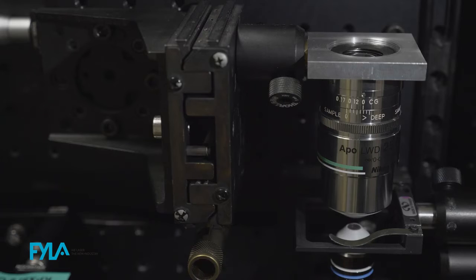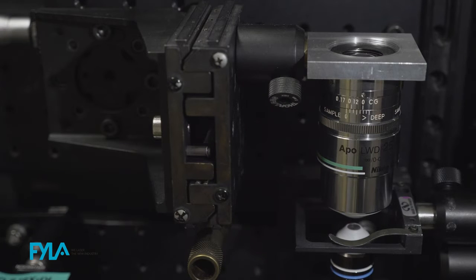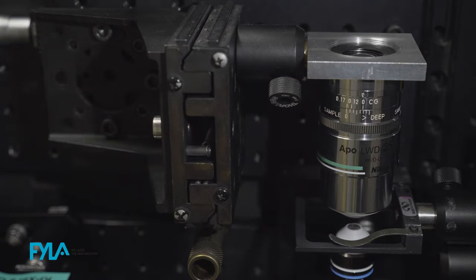The second major component you need to think about is your microscope objective, in order to have a very tight focus. And for that, you'll also need to have as many photons in one place at one time as possible. So you need a microscope objective to focus really small.